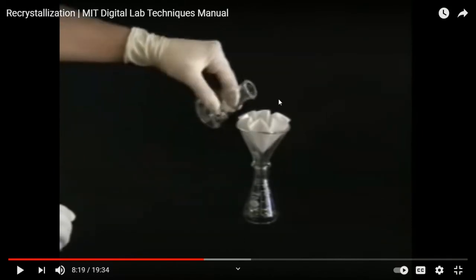Okay. I modified this one in my grad school when I was a TA. We already changed this one, made it better than this MIT lesson. What we did and what I am doing at your college is making the setup better to keep everything hot. Do you really think you have a coffee filter and pour the hot water will make this whole thing hot? I don't think so, right? It's gonna get cooled down instantly. Not hot enough. It may be just still warm, but you have to have a boiling going on to dissolve your crystal, right? That's the step 2 we've done.